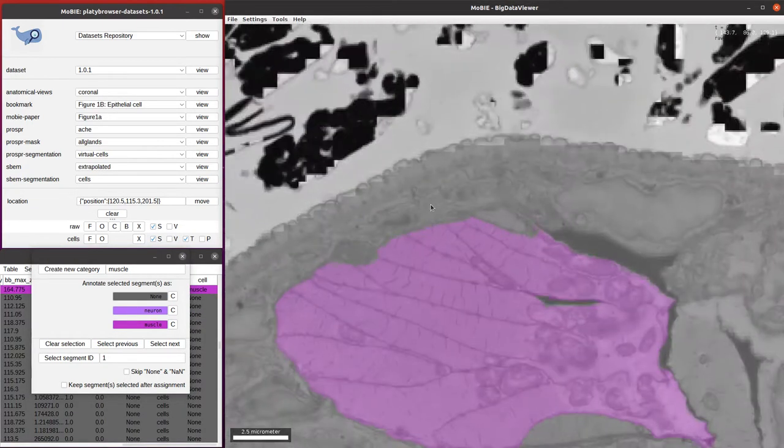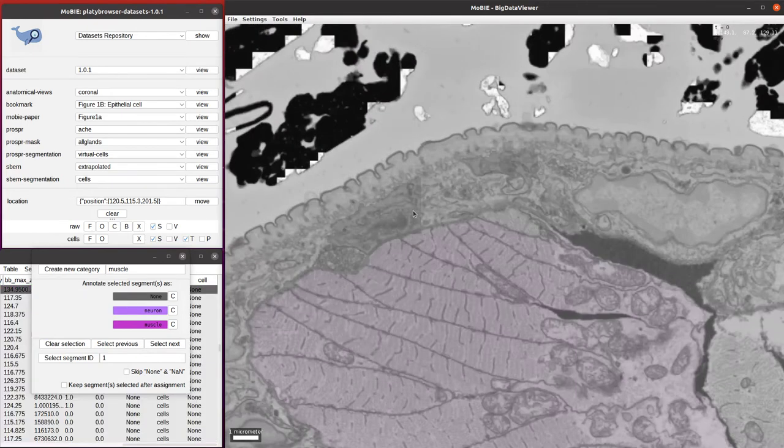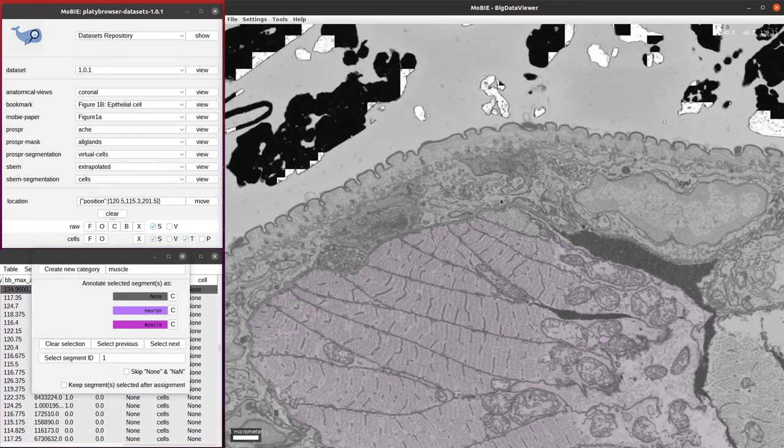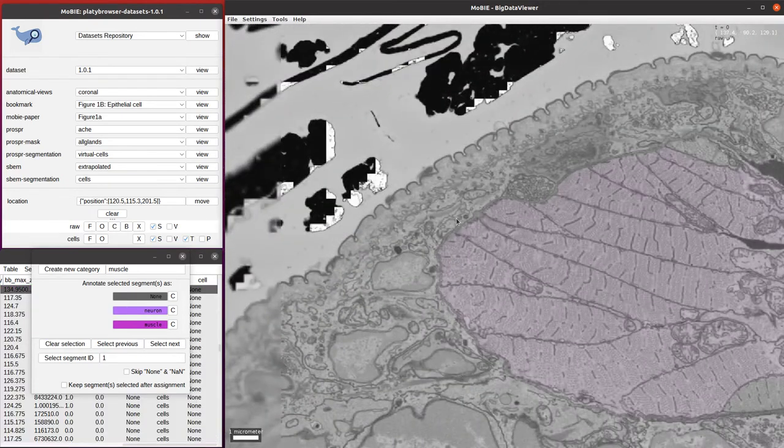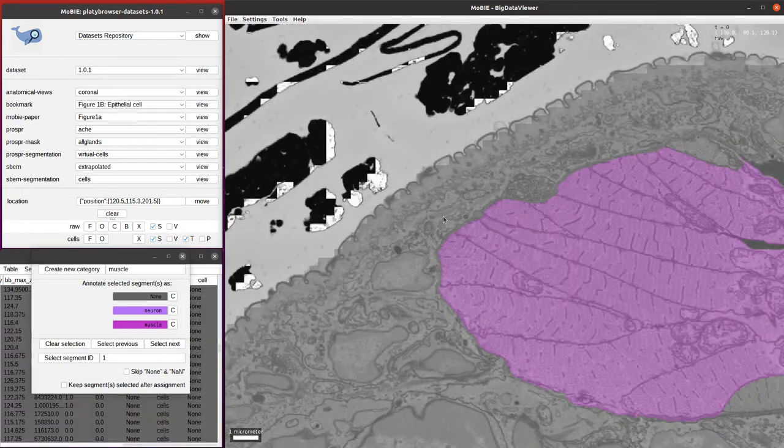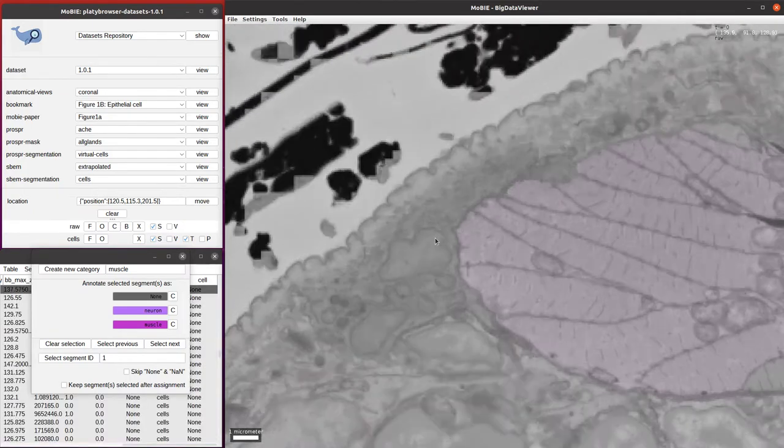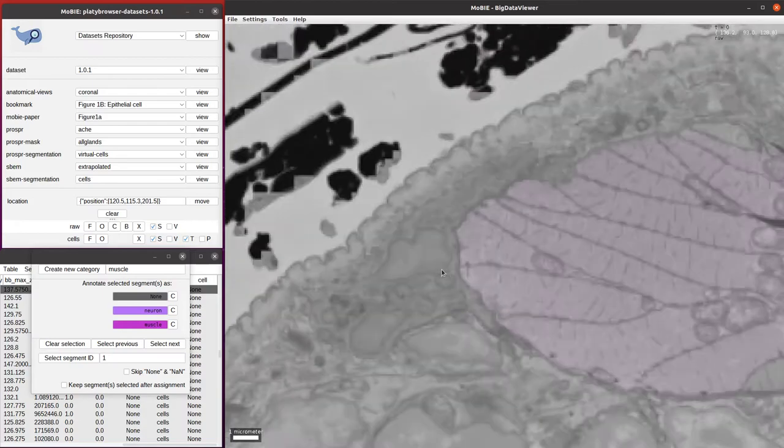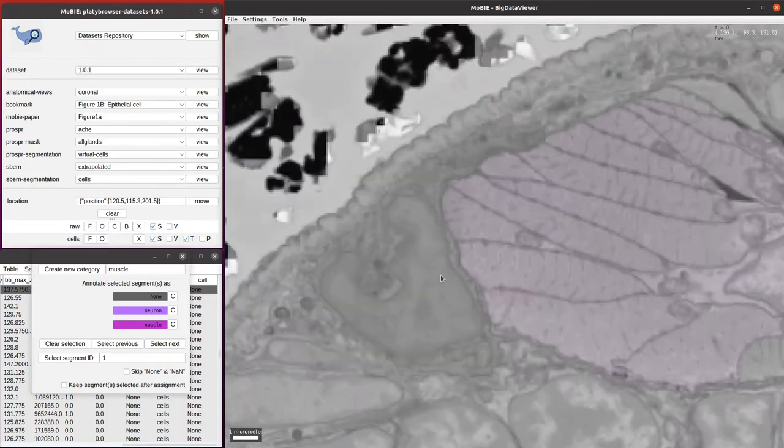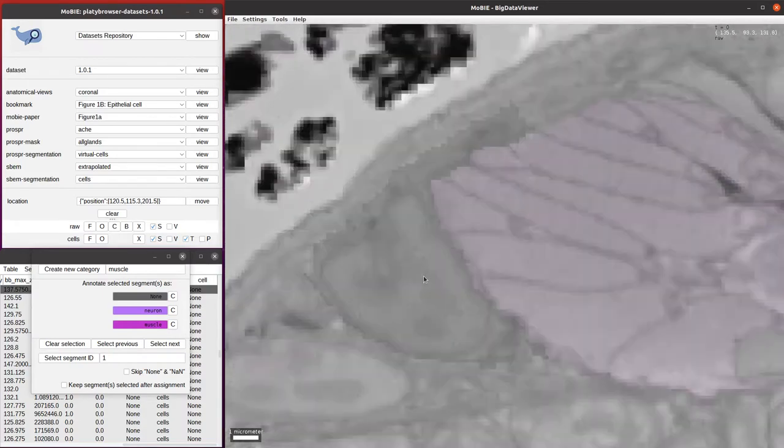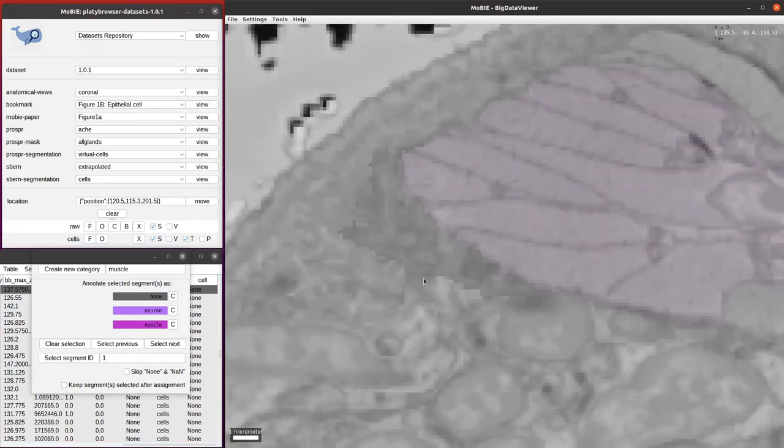We can click on another cell up here, and this one we see it's just a fragment. This is because it's an automated segmentation and there are some errors inside. Let's select another one. This one looks more complete, and we can see because it's right under the surface of the Platynereis, it is an epithelial cell.